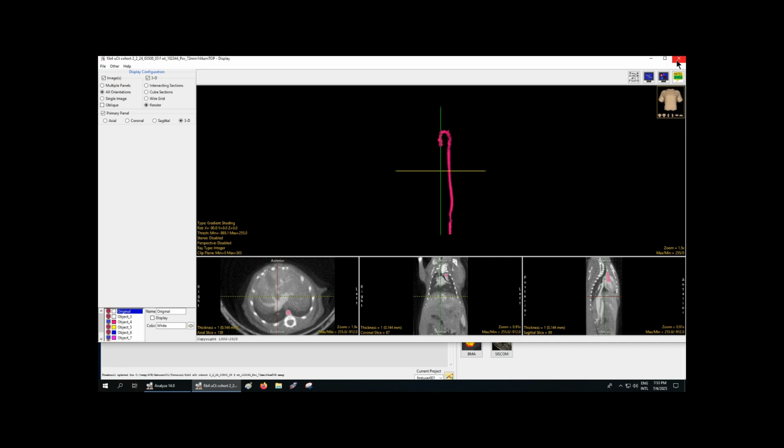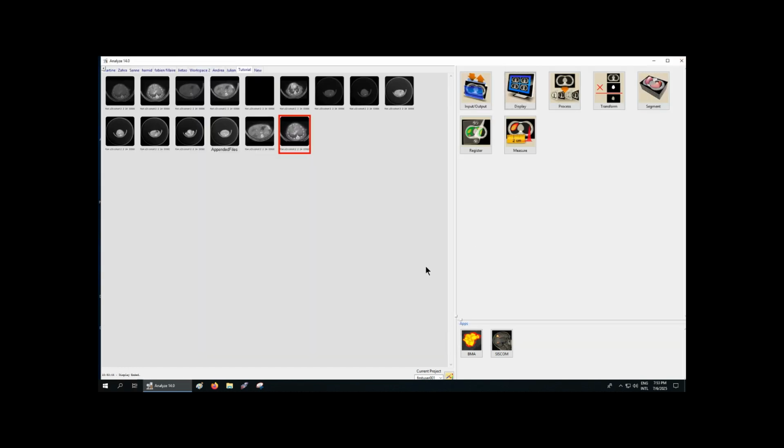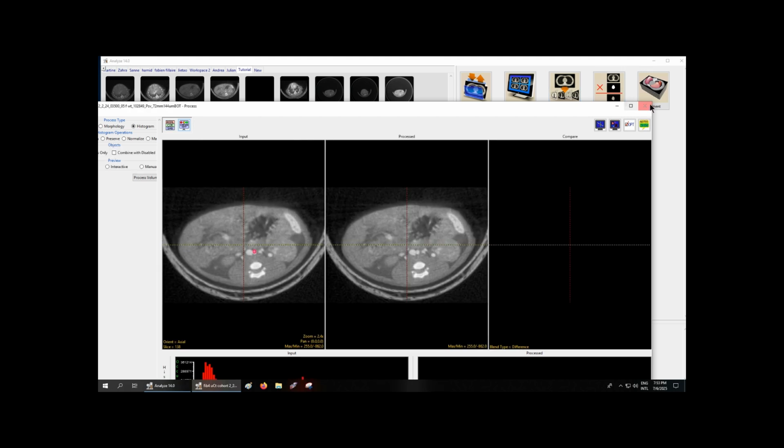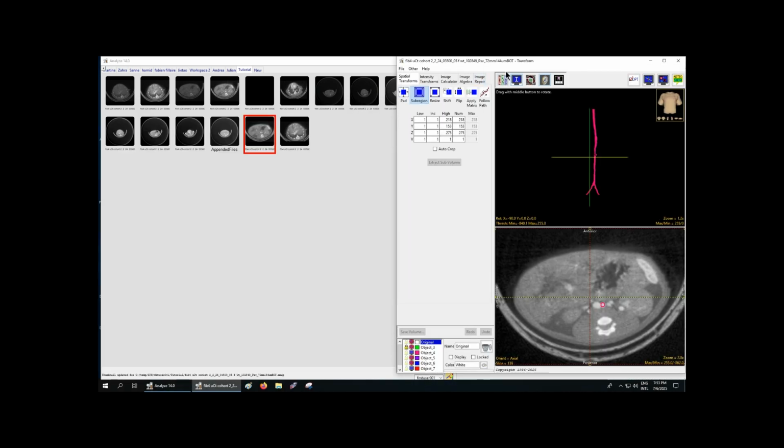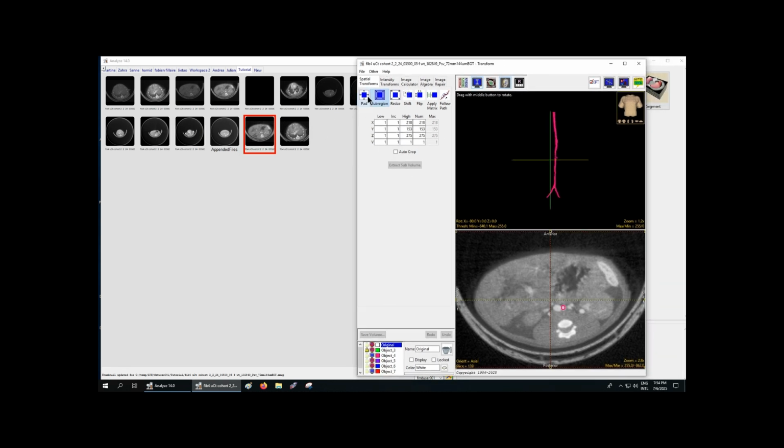Now this method is actually just a combination of part one and part two of the stitching process. So we'll start by padding this again using the transform module. We'll be padding it with roughly 300 voxels, with disabled equal padding, pad volume.